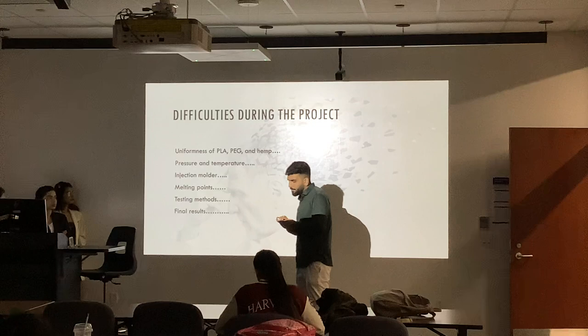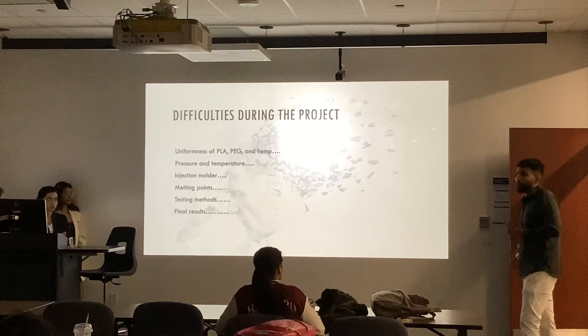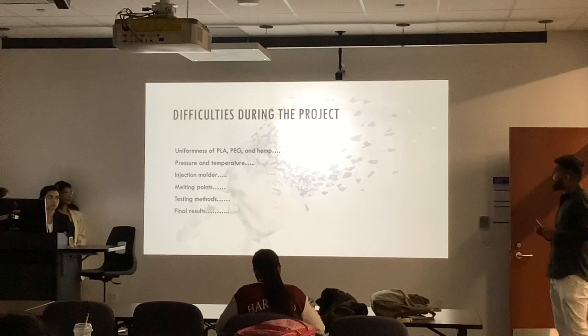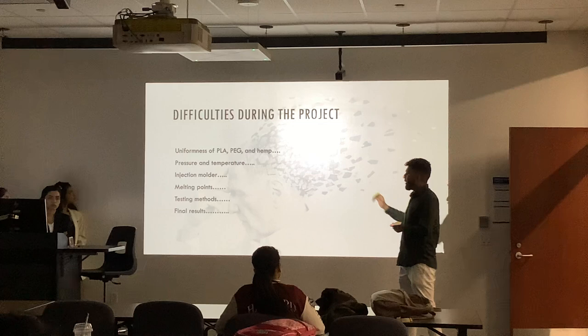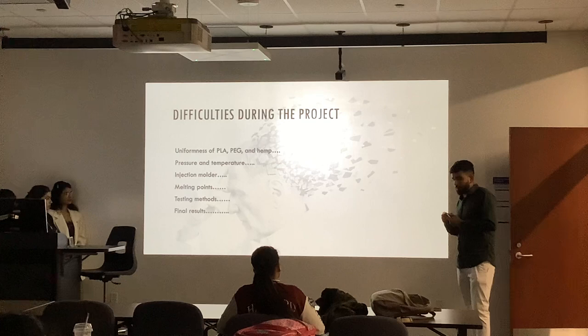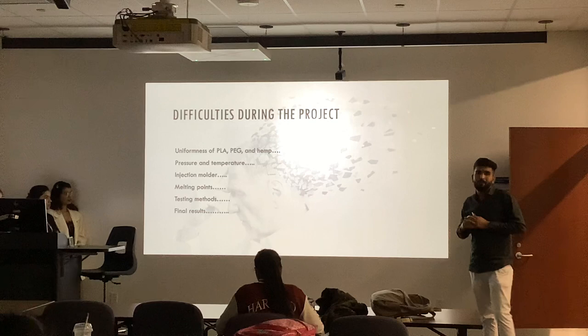The impact tester in our laboratory is designed for cylindrical shaped materials, but the dog bone we got from the injection molder was cuboidal, so we were not able to accommodate our sample in the impact tester. For the tensile machine, we were not able to get the breaking point and tensile strength because when the sample was accommodated in the tensile machine, the sample came out instead of breaking from the middle — because of the clamp issue. And we didn't get clear images in the microscopy.